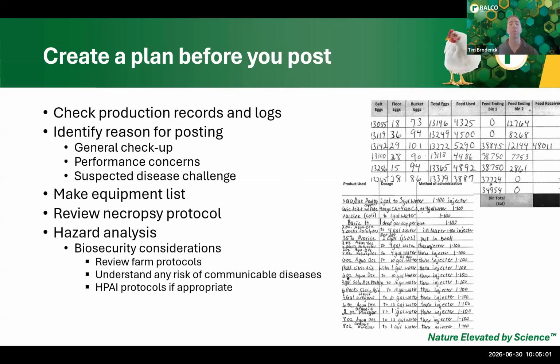Also, we want to make sure before stepping in a barn that we're doing that hazard analysis, looking at biosecurity considerations, adhering to any farm protocols if it's not our own farm, and even if it is, making sure that we don't have a risk of transmitting something between barns or flocks.